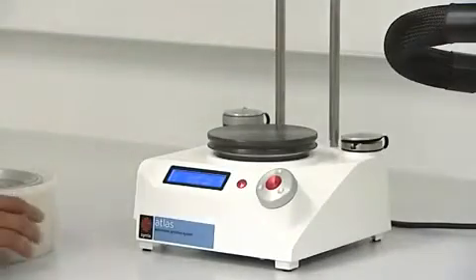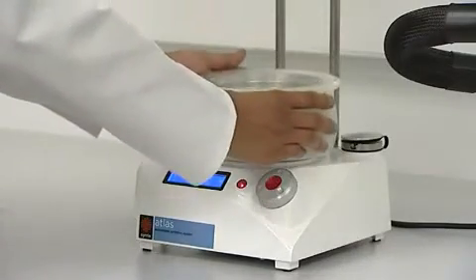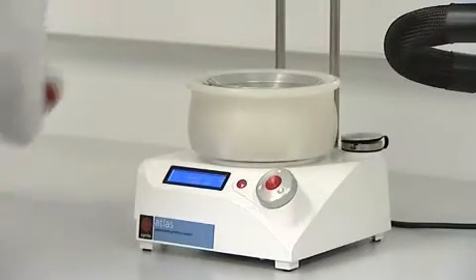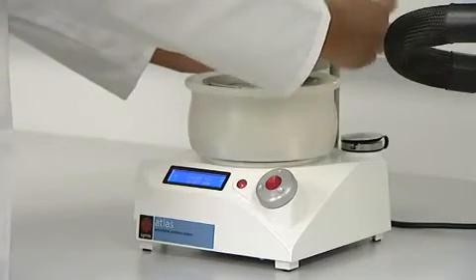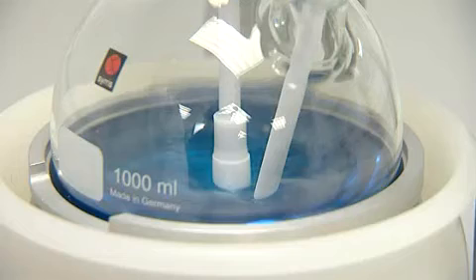The Atlas lithium and sodium systems automate reactions in round-bottom flasks. The Atlas hotplate and stacking dry bath rapidly heat round-bottom flasks from 50 ml to 1 litre, yet the exterior surface remains safe to touch.